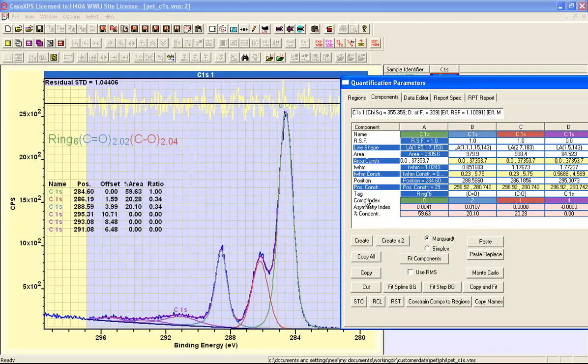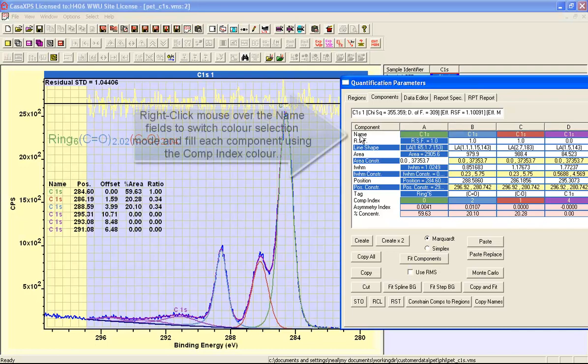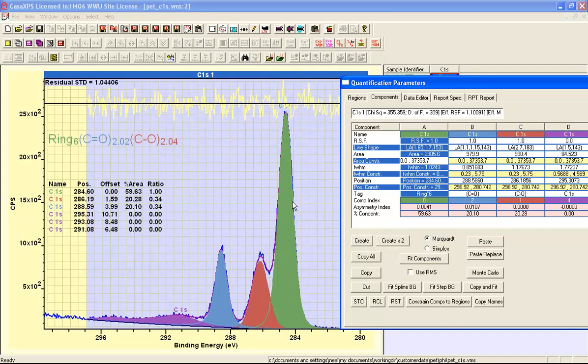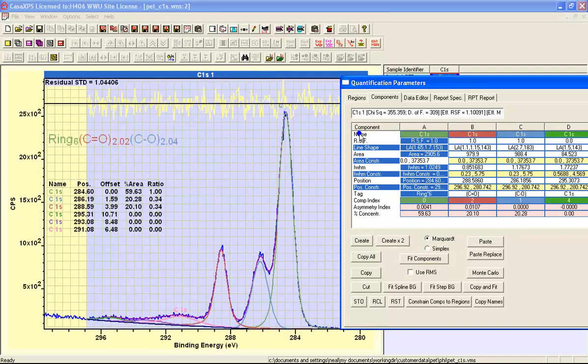There's another option associated with the name field that if I right click here then not only are the colors switched but the display is such that the components are now filled using the colors. If I click a second time then the display goes back to the state where the components are not filled.